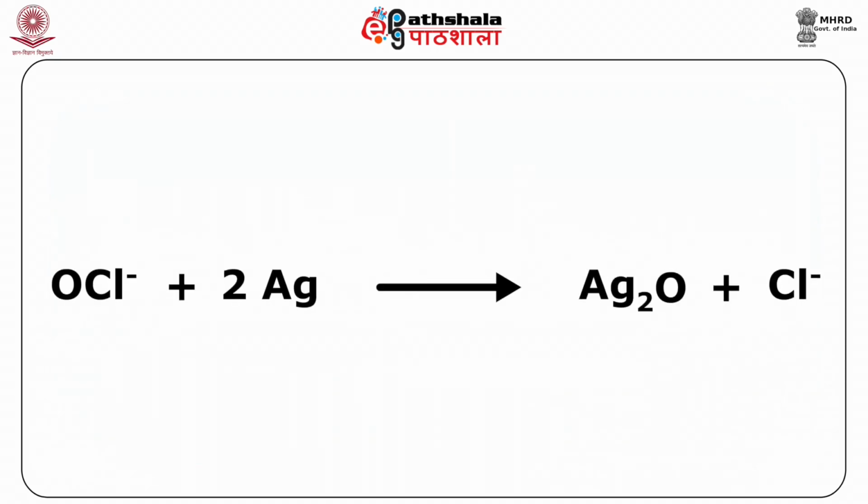The silver particles adsorbed on the fatty acid and lipid constituents of latent impressions are oxidized to silver oxide, which is generally known by the name Ag2O, by the hypochlorite ions.